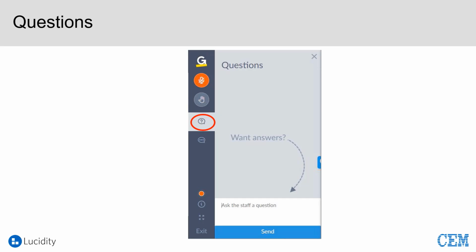One of the things I like about the Lucidity system is that it actually uses the same inlet liners and the same inlet geometry that you see on a traditional Agilent or, back in my day, an old HP GC. So it's all the same inlet liners, same inlet geometry, which means SPME should work like a charm on it. And that's one of the nice things I like about what's going on with some of these miniaturized systems, that they're still using components where you interact with them, like the inlet, from larger systems, and I think that's a good thing. And that actually makes it flexible, that anything you could put into that Agilent inlet, you can probably stick into the Lucidity inlet as well.